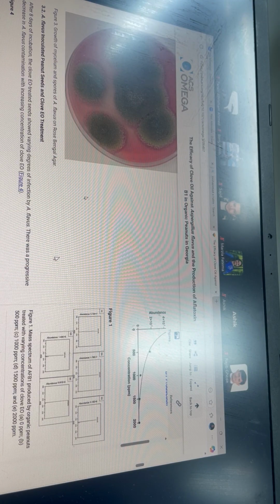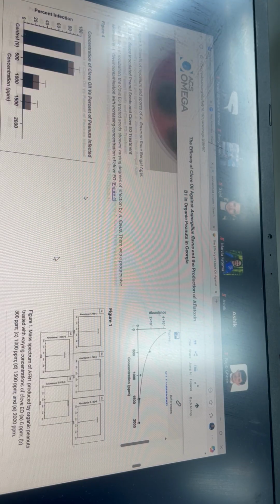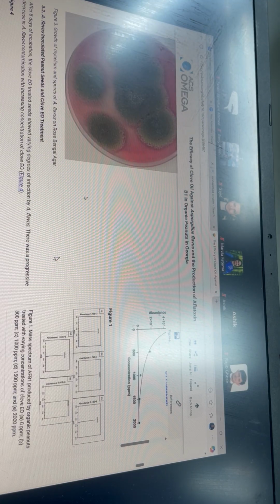Here I am a bit confused: how can we estimate a metabolite against a formula calibration curve using the main standard, ciprofloxacin?